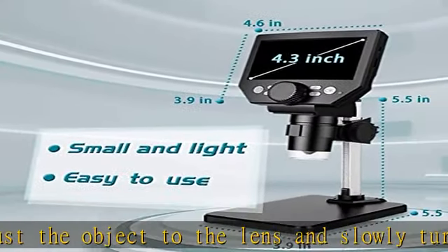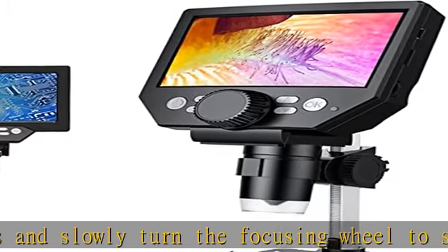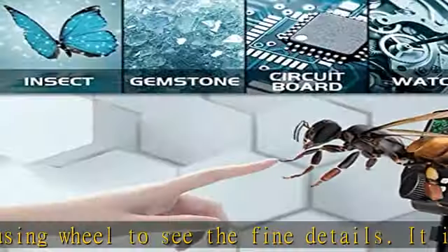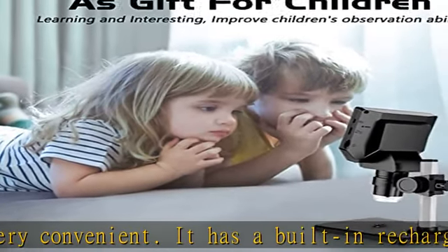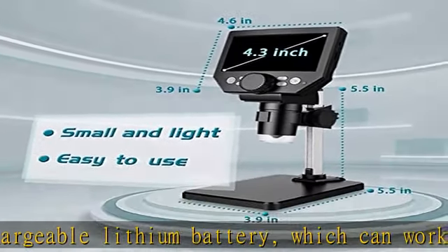The 4.3 inch high definition LCD screen and 32 GB card allows the microscope to capture a clear, detailed view of the object, record video, and record a clear micro world experience. The images and videos obtained during observation are saved to a 32 GB micro SD card, which is included.